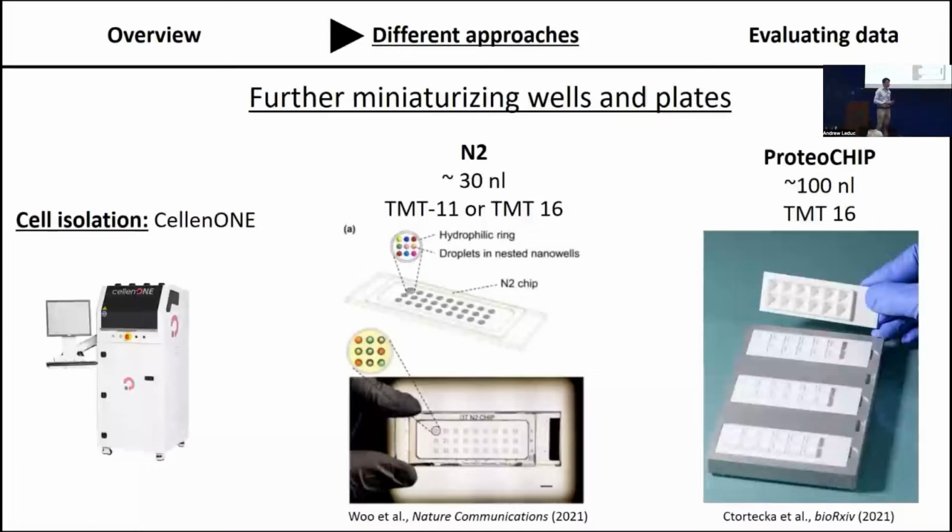And so these methods also rely on the cellenONE, which is a really gentle cell dispensing and liquid handling system that allows for these processes to be automated further, and allows for this fine precision that can allow you to reduce volumes and spatially take advantage of fine grained XY coordinate dispensing past what you'd have with a FACS sorting instrument.